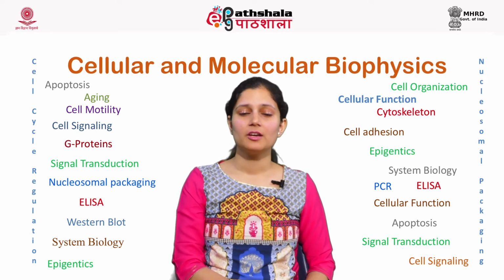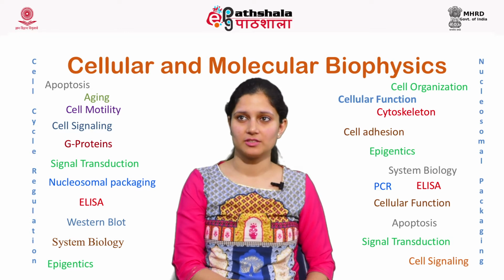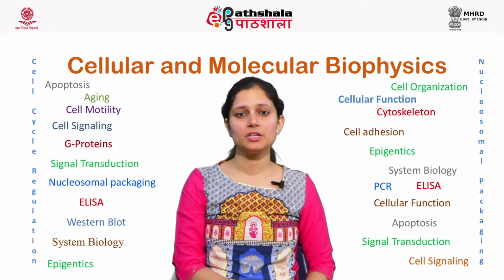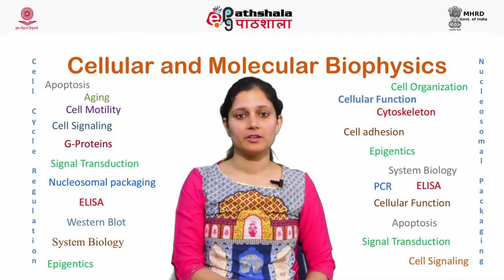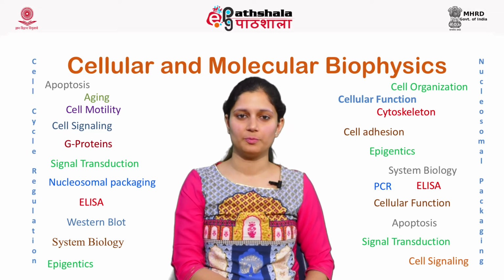In this module, we will be understanding the basic concept of polymerase chain reaction and the 3 steps involved. We will also discuss the instrumentation and different components of polymerase chain reaction, or PCR. In addition, we will discuss reverse transcriptase PCR and real-time PCR. Finally, we will enumerate the wide variety of applications of PCR in medical research and diagnosis.